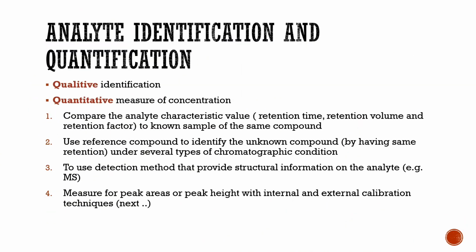Now, after separating the components of the mixture, we'll have different analytes that can reach the detector and can be identified. This is for quantitative measure of concentration, or it can be visually identified for qualitative identification.